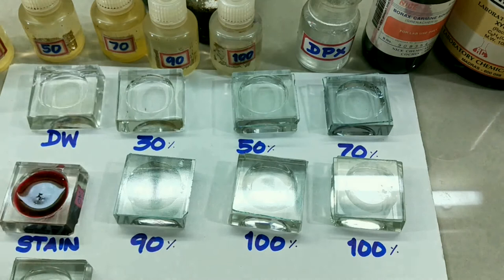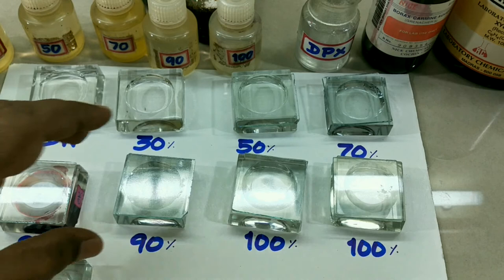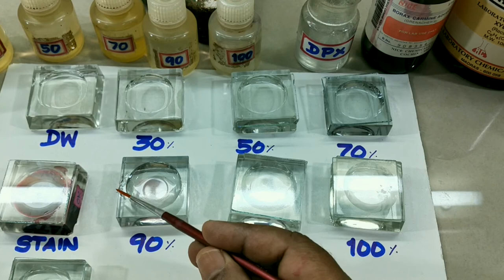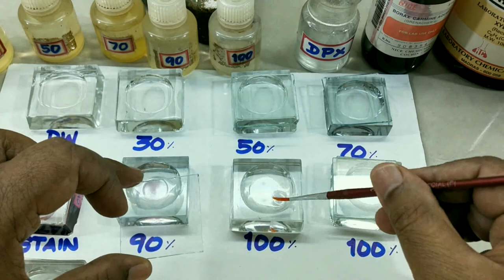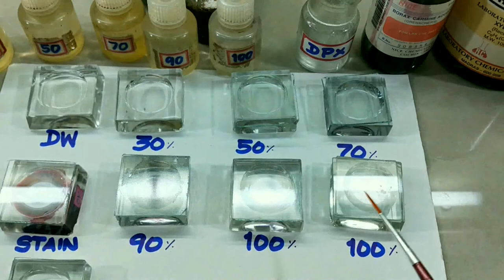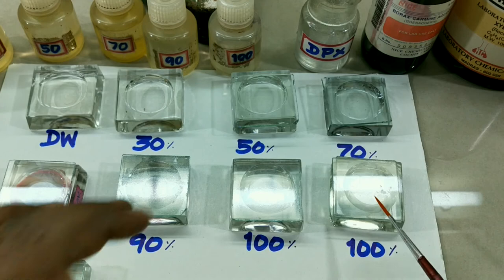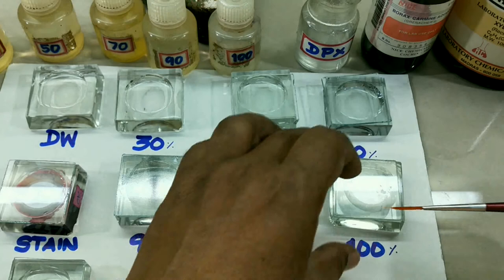After five minutes we are continuing the dehydration. Take it from 90% alcohol and transfer it into absolute alcohol to get complete dehydration. After five minutes, transfer the material into once again another fresh 100% alcohol. The fifth step is clearing — the alcohol is replaced with xylene, which imparts transparency to the animal. This is called clearing.